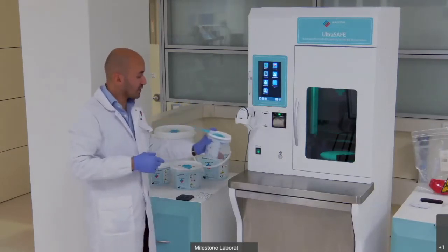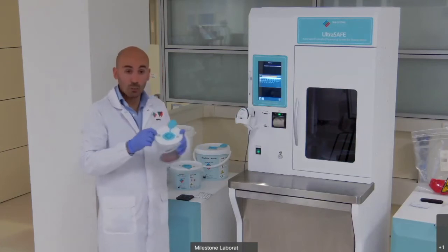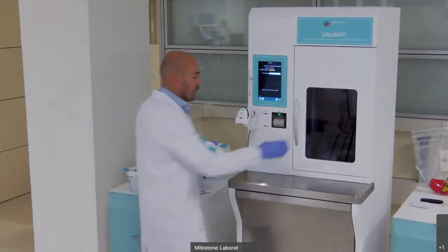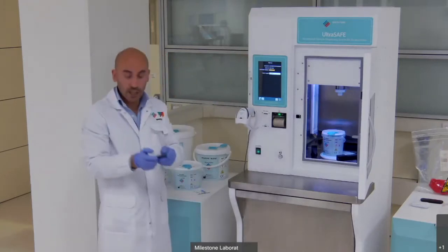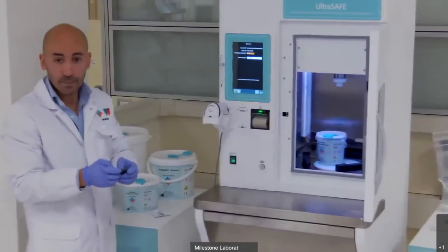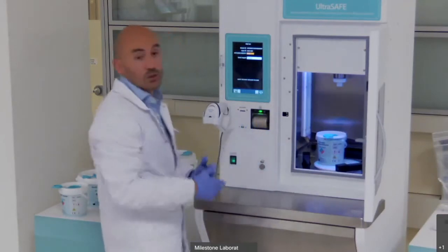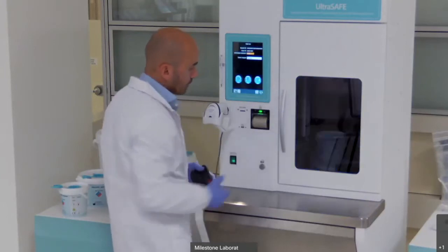As in the previous instrument, I need to scan one of the barcodes on top of the bucket, scan the requisition form of the patient, and place it on top of the scale. I will slightly zoom to give you a better sight. On purpose, I put it off center, because one of the features is that the system will automatically center the bucket.